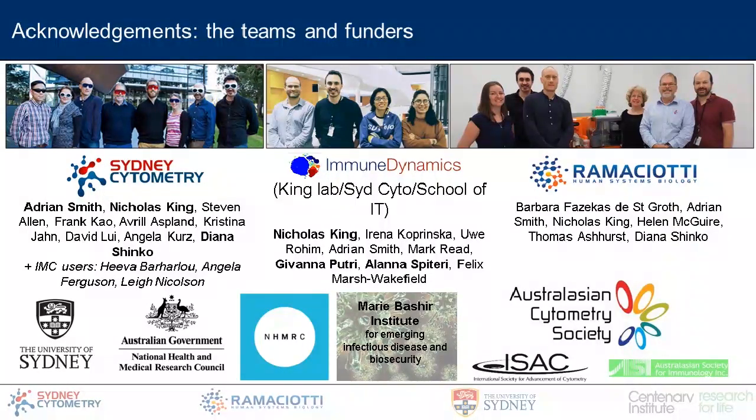Rather than each experiment having to be analyzed independently or clustered and visualized independently, what we'd like to be able to do is take that batch alignment type approach, which I touched on before, to be able to integrate data sets over time. So if we have, for instance, a reference map of immune cells, you can take a new data set which is generated using CyTOF or Flow or whatever, integrate that into the existing data set and do that kind of label transfer.